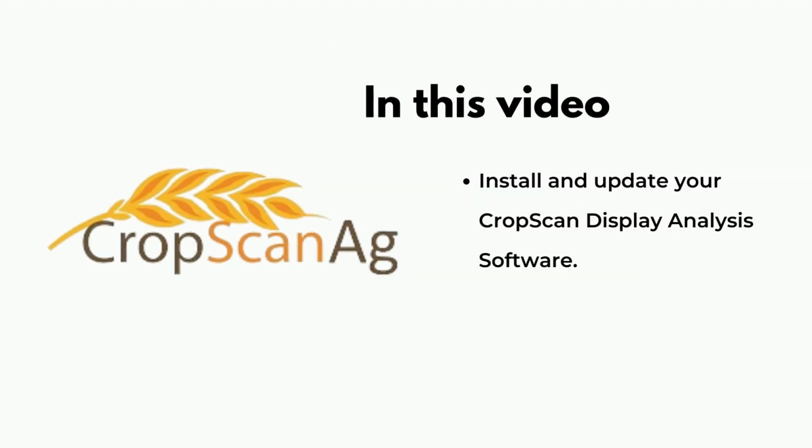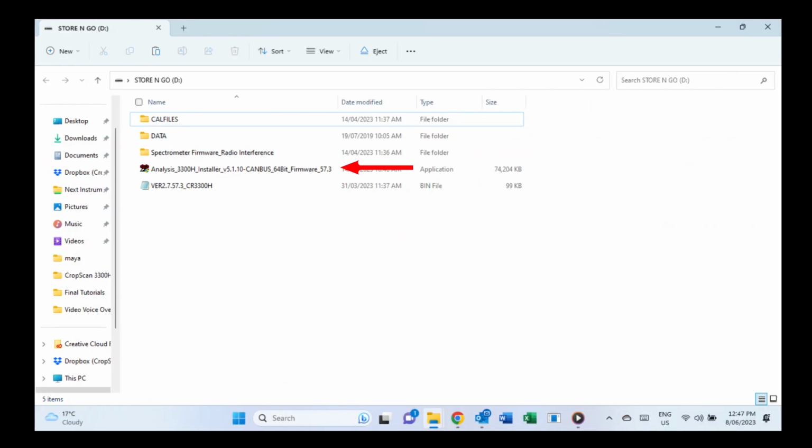Hello, in this video we'll show you how to update your CropScan Display Analysis software. Download the correct version of the CropScan Display software and copy and paste it to the root drive of a USB. One is provided in the accessory kit.